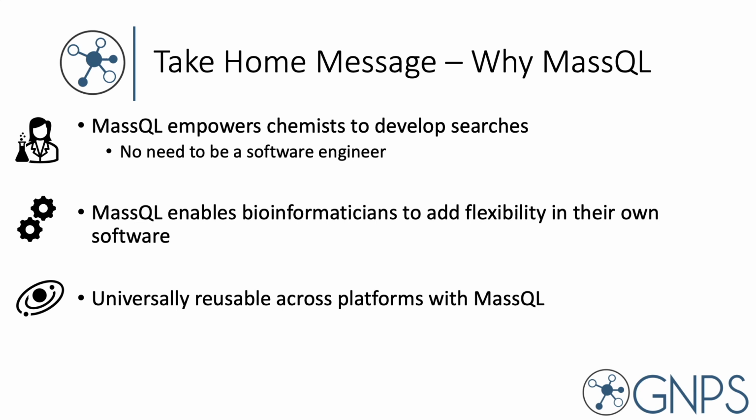And also, we hope that MassQL, just because we've made it a vibrant software ecosystem, enables bioinformaticians to integrate into their own software to give them the flexibility to also query for patterns that they might want to look for as well. And then finally, building upon all of this, once we have a software ecosystem integrated into bioinformatics software for the community, we hope that it's universally reusable in a way that a real language is. Simply copy and pasting a query that you've written and sharing with the rest of the community and others can apply it seamlessly, that's kind of the dream.